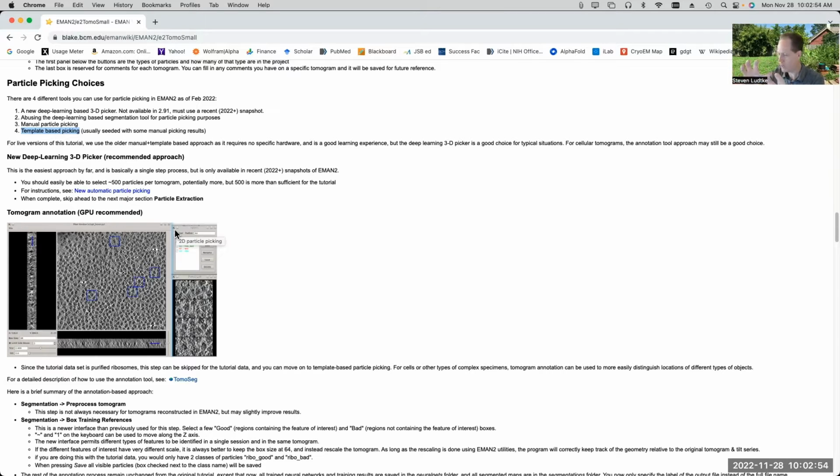Even a 1 degree rotation is enough to make the helices and stuff slightly misaligned. So you have to really generate thousands and thousands of projections. And then each of those projections you have to cross-correlate in 3D with the entire tomogram. It can be a very computationally expensive process.